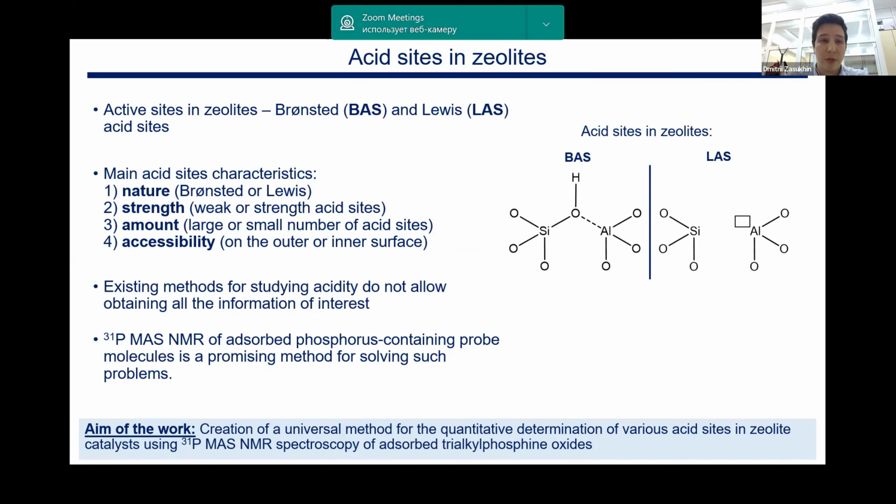So the aim of my work is the creation of a universal method for the quantitative determination of various acid sites in zeolites using 31P MAS NMR spectroscopy of adsorbed trialkyl phosphine oxides.